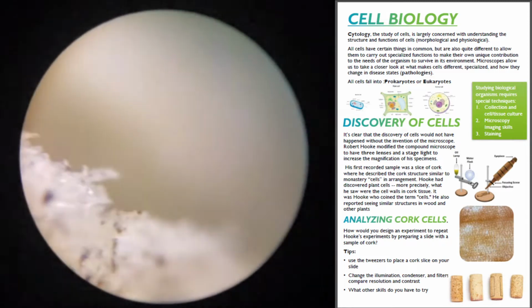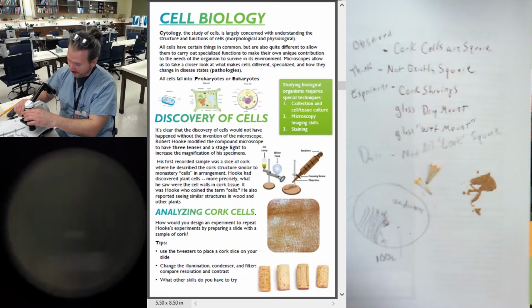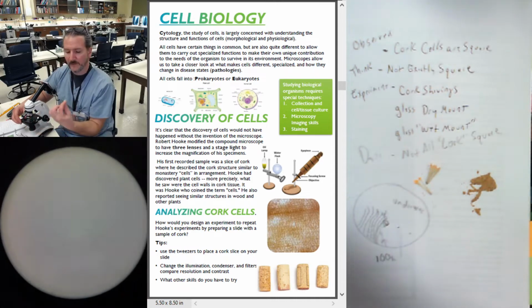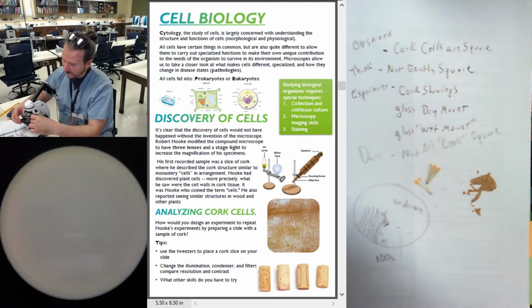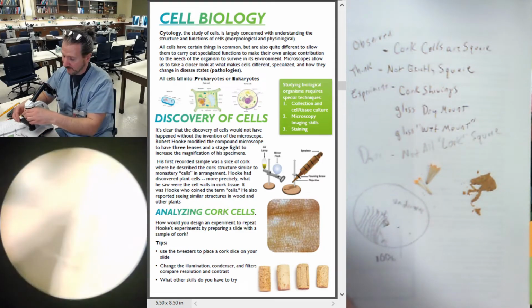I'm going to go crazy. I'm going to go all the way up to the highest magnification. Oh, yep. So crazy, I actually just pushed my shaving right off. Experiment, see what you can see. Maybe break this up into smaller parts, put it back under, with a drop of water, see what happens.